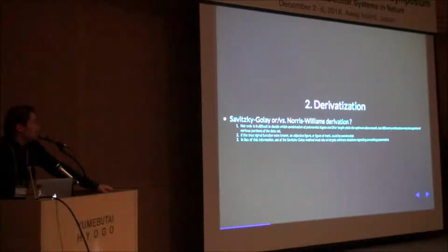However, all these, Savitzky-Golay precisely, have been the method itself. With Savitzky-Golay filters, we can do smoothing as well as derivatization. And a nice paper that I have included shows the three points that you can see here, which are the main points of concern. And what I want to emphasize is that they're also the main points of development in using these methods, and that you can read them. I don't want to read this.